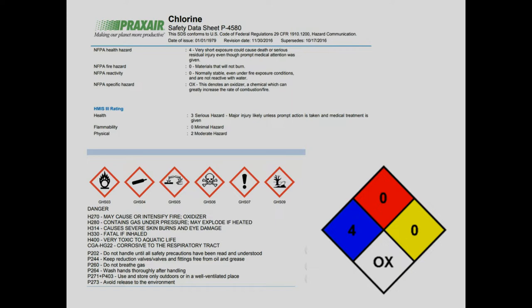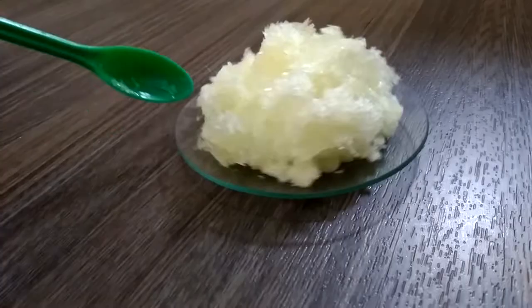Chlorine is extremely dangerous. This experiment should only be done in a well-ventilated area.